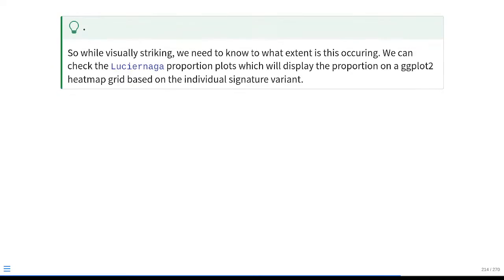So it's visually striking, but we also have to remember this is rather sensitive. If a single cell has a different signature, it will also be plotted in the same kind of wrapper view. So we should try to see what the actual proportion is in distribution, because if it's just 3 cells that have these weird signatures, but everything else remains the same, we don't have to worry about it. We can continue doing regular style gating to get at our underlying signature.